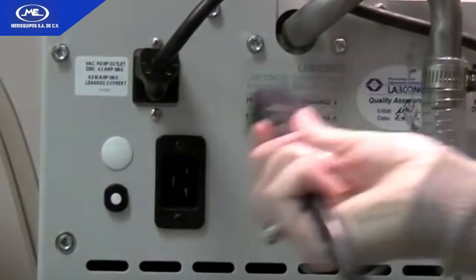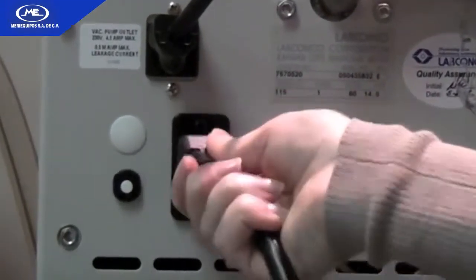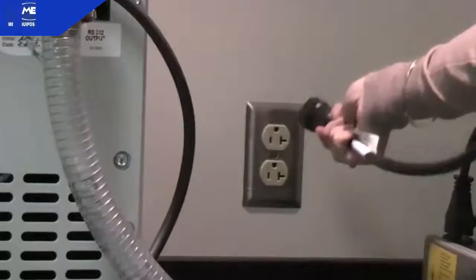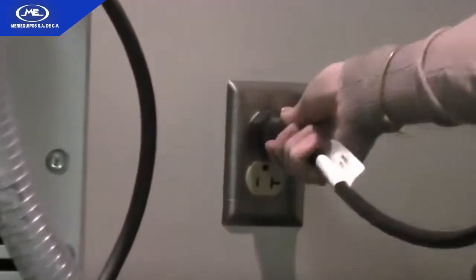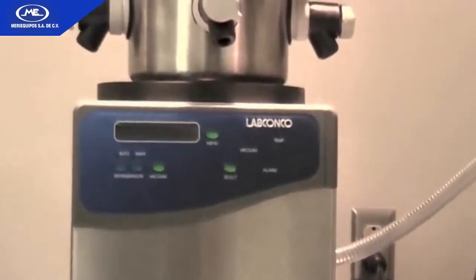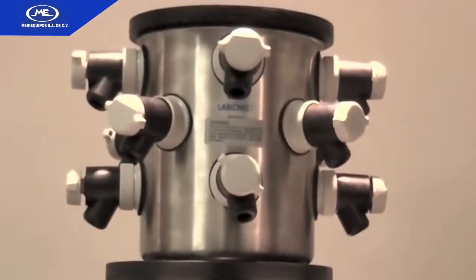Connect the freeze-dryer's power cord into the receptacle on the back of the freeze-dryer and insert the other end into a suitable wall receptacle. Your Freezone benchtop freeze-dryer system is now ready for use.